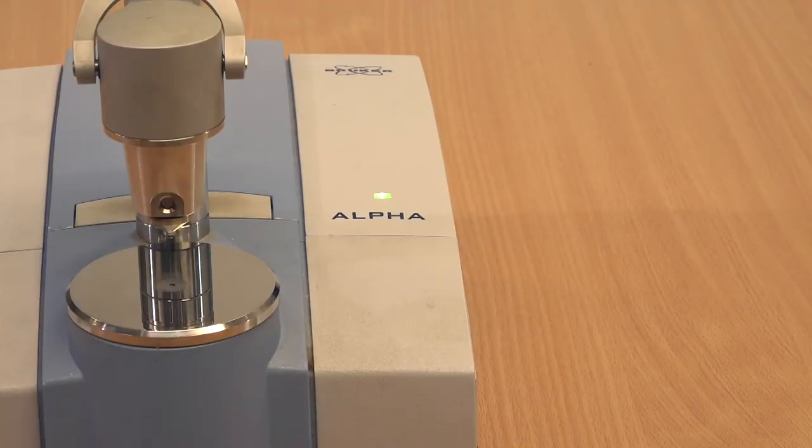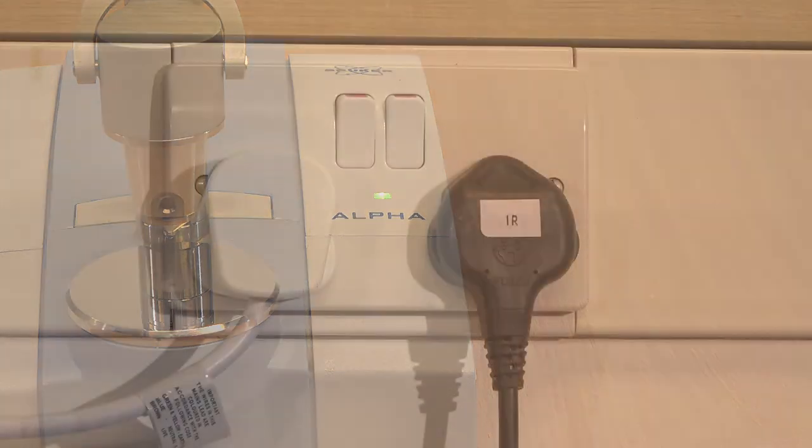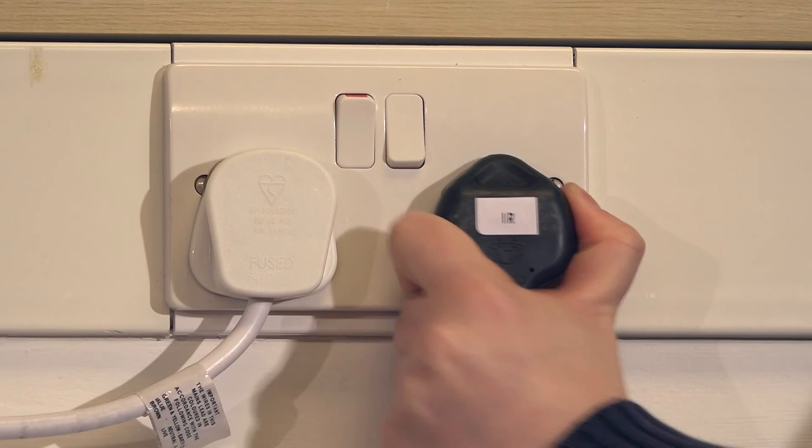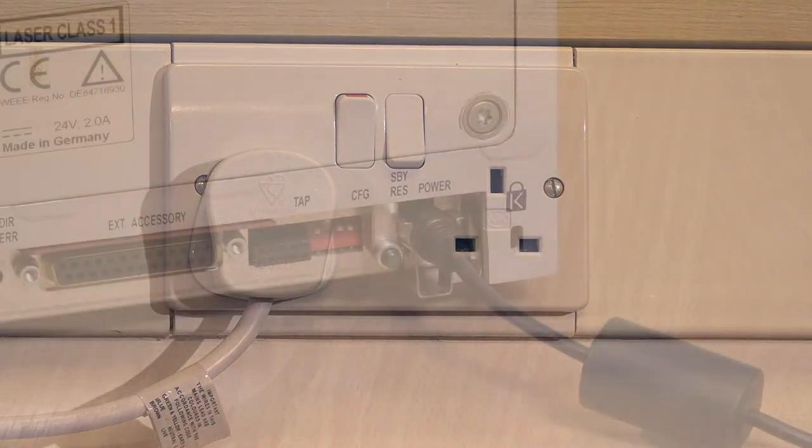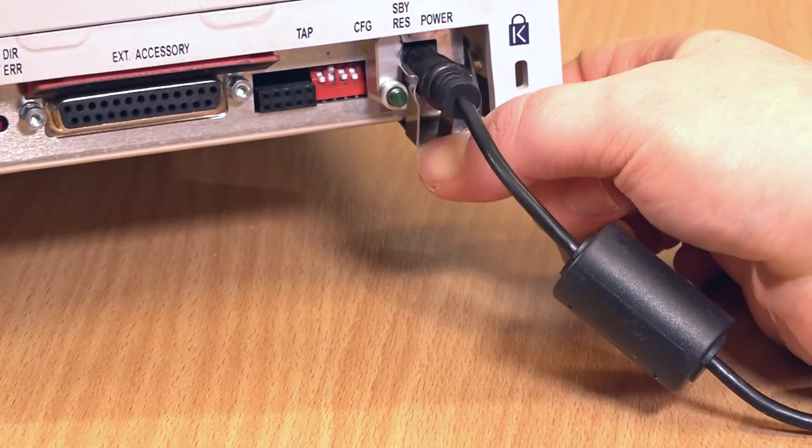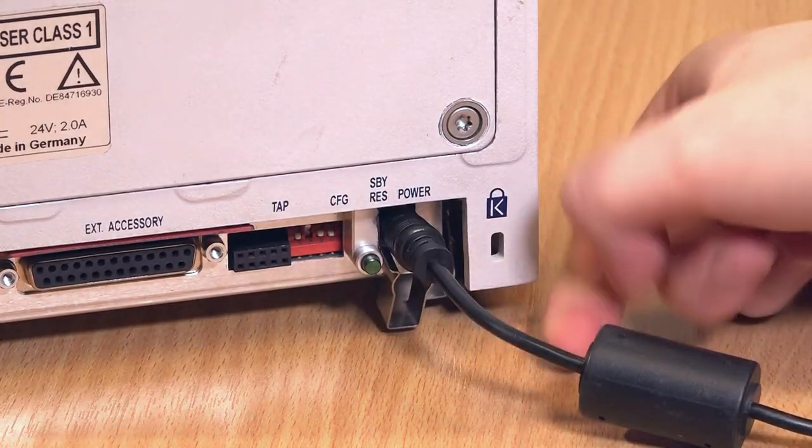If you have another class later on, leave the IR unit plugged in and switched on. Otherwise, switch off the IR spectrometer at the wall socket and disconnect the power supply. Remember to remove the metal clip from the power cable before you take the plug out of the spectrometer. Also, disconnect the ethernet cable from the spectrometer and the laptop.